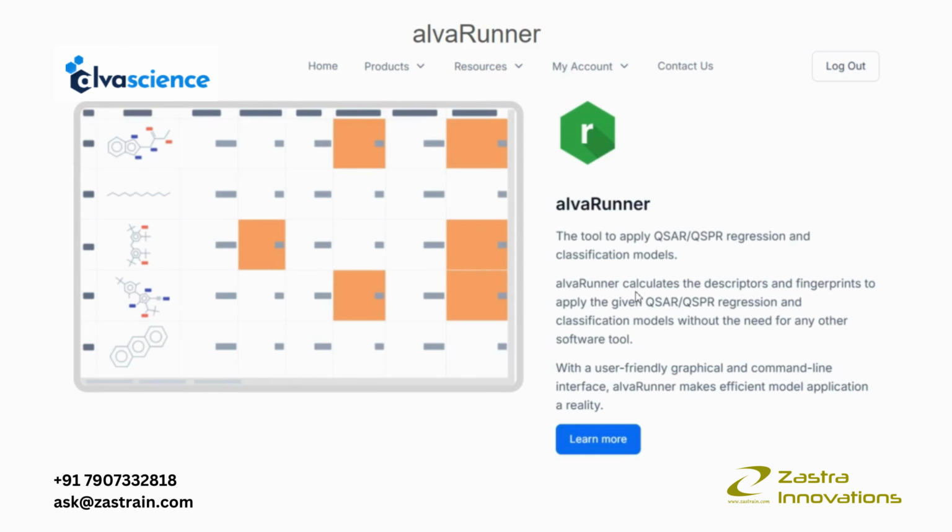Alva Runner specifically calculates the descriptors and fingerprints which can be applied to a given QSAR or QSPR regression and classification model, and it doesn't even need any other software tools. It is user and graphical friendly, and it can also be operated from the command line.